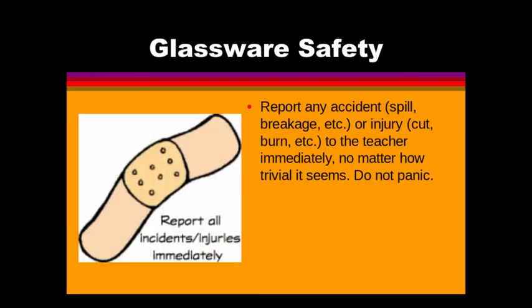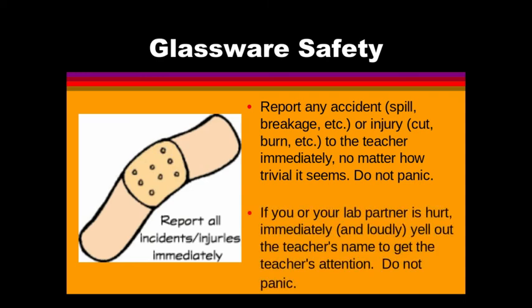Report all accidents and injuries immediately. It could be a spill, it could be a break, it could be a cut, it could be a poke. You need to let me know. We don't need to panic. In most cases, I'm just going to say, go wash your hands with soap and water. Let's put a Band-Aid on it. I'll send you to the nurse if we need to, so she can take a look at it. Most of the time, it's not that big of a deal. You need to get my attention so that I can get over there right away, because during labs, there's usually lots of talking.